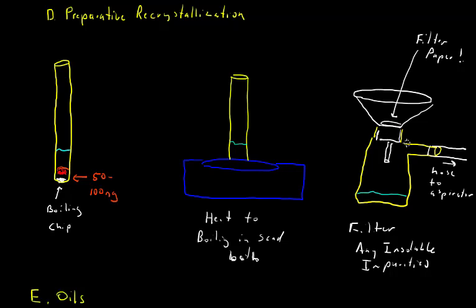If you turn the aspirator off rapidly, there's a vacuum in here, and the lack of pressure here will draw water back in. And when you're collecting your crystals at the end, that's not a problem. But if you're doing this when you want the filtrate, that is when you're filtering off the insoluble impurities earlier, pulling a lot of water in here is going to ruin your experiment, because the filtrate is what you want. So whenever you're doing a vacuum filtration with a water aspirator, you either unplug this first or turn it off very, very slowly. Those are probably the two best things to do.